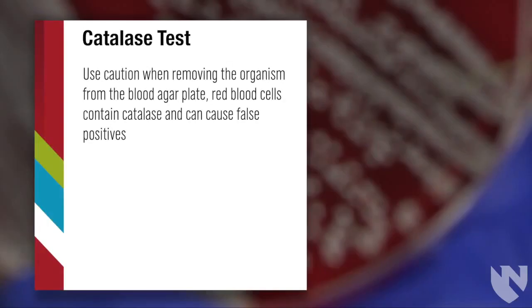Use caution when removing the organism from the blood agar plate. Red blood cells contain catalase and can cause false positives. As long as you do not gouge the agar, you will be fine.